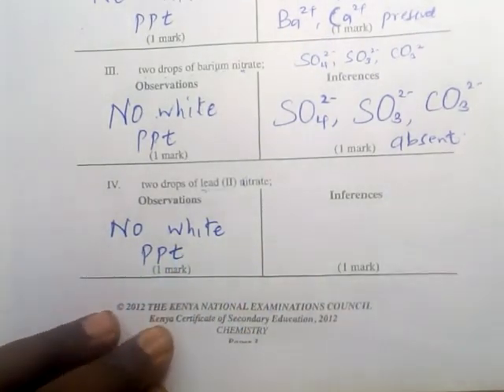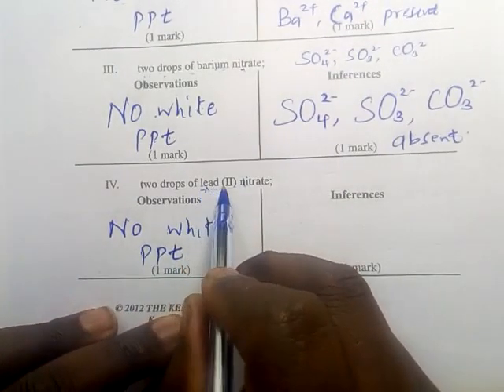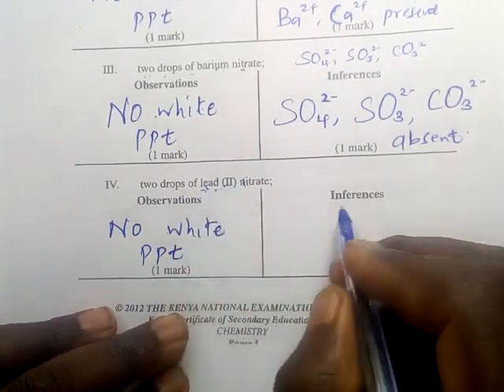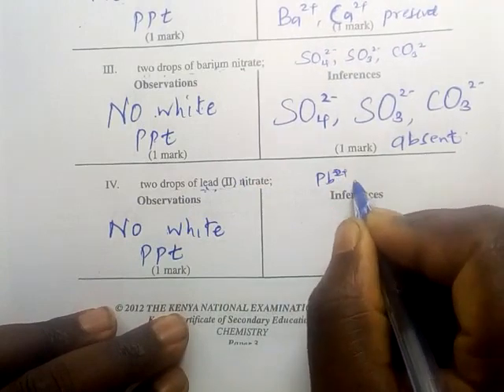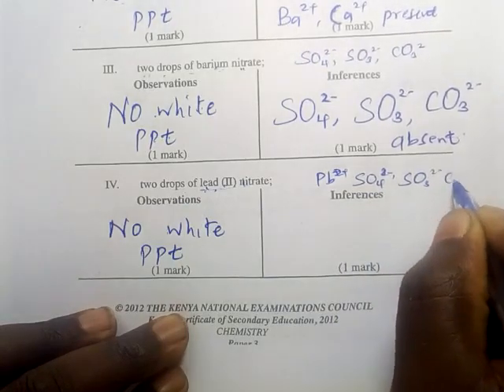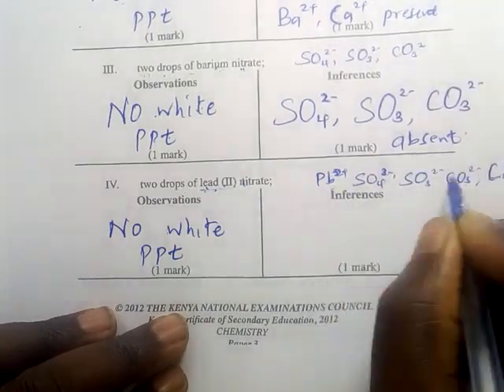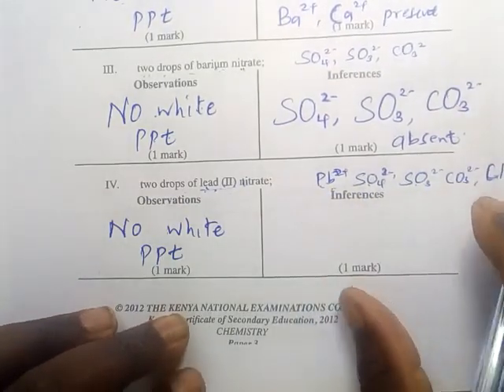Lead will form a white precipitate with chloride, with sulfate, with sulfite, and with carbonate. Lead chloride is a white precipitate. Lead sulfate, lead sulfite, lead carbonate are white precipitates.